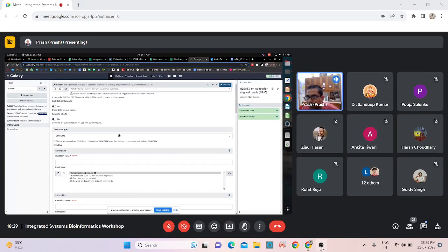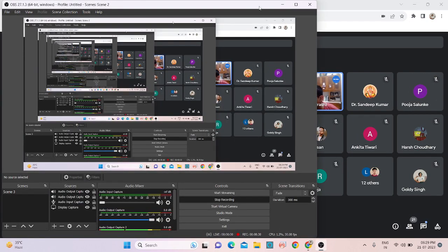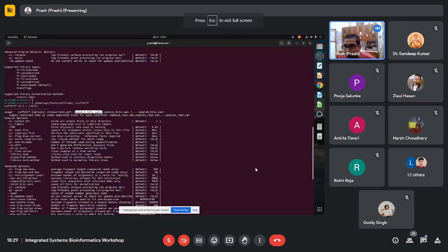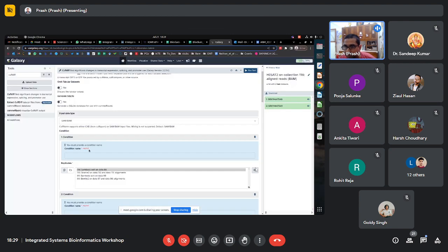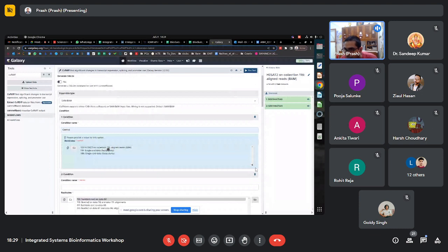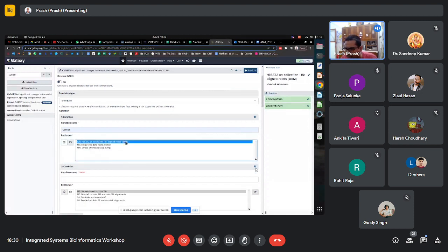And here you give SAM or BAM, as I told you, if you remember this particular command. SAM or BAM for your control now. So now you do this SAM or BAM, and then you define it as a control. Take this data set collection and choose that. In fact, it should be individual, but it's not there. Individually, this ID is not there. If it were there, otherwise it has to select. It has to read this.